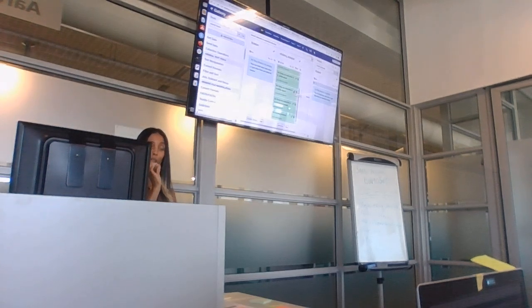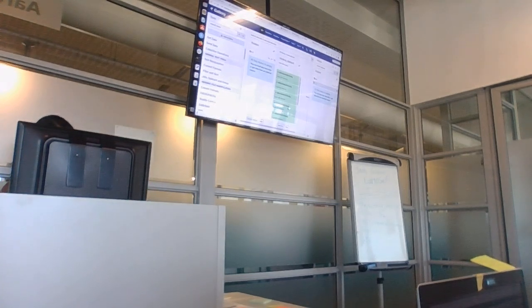We're going to use one of those files, the one ending in 88, and we're going to drag it from the cholera into the Kraken so that we can do an analysis in the Kraken directory or history. So you can open this, I hope, because you can open this and drag it.